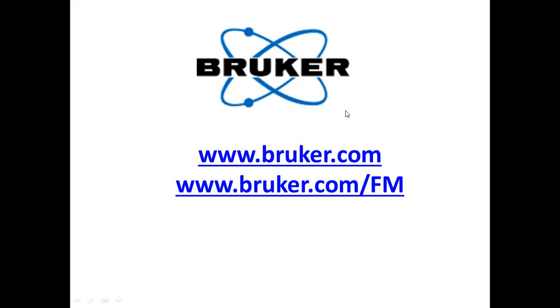Okay, yeah, so maybe you preempted this one as well, but is super resolution used with snap and clip tags, and maybe you can give a little background on what those are for the other members? Okay, yeah. I've seen it getting a little bit more popular in the last probably year or so.